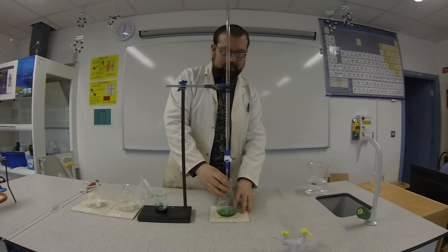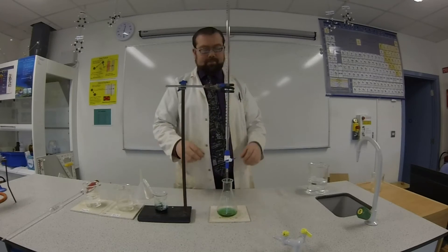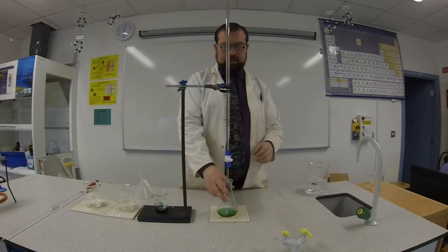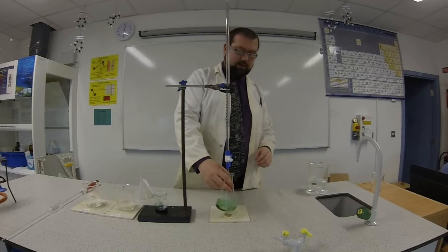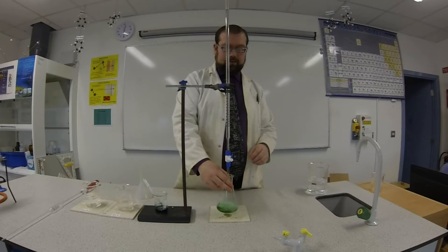I've got my conical flask. As I say I've got 25 centimetres cubed of sodium hydroxide in there as well as a little bit of indicator. I'll just release the acid in there and swirl it. As soon as I see any kind of red colour change I'm going to start slowing this down because I want to try and get an accurate measurement if possible.